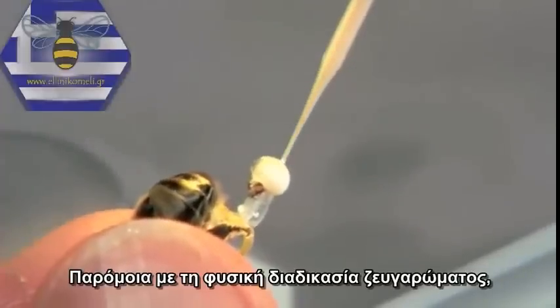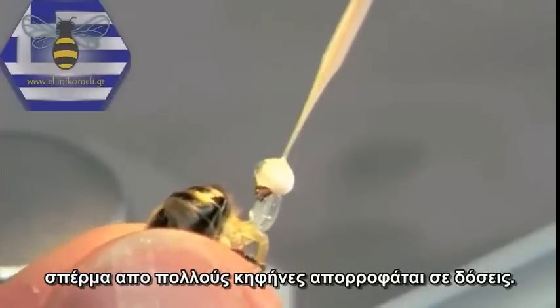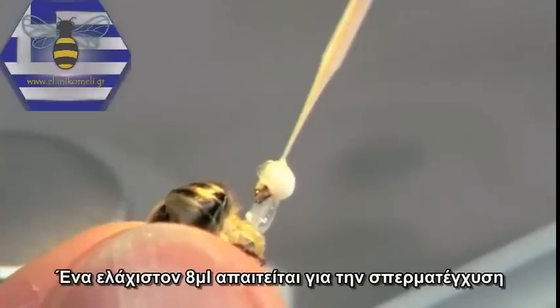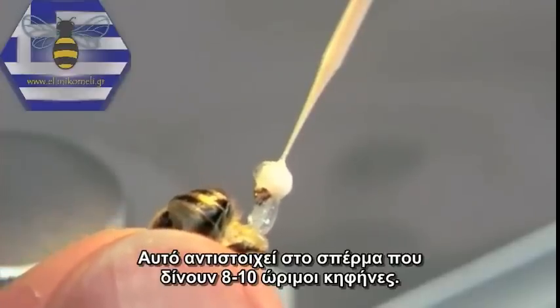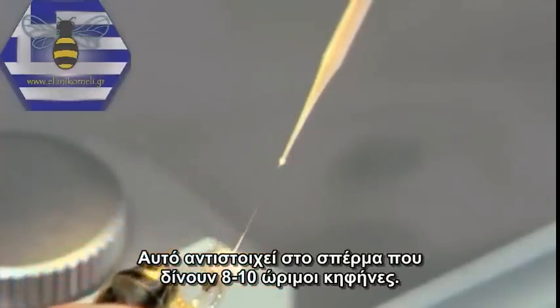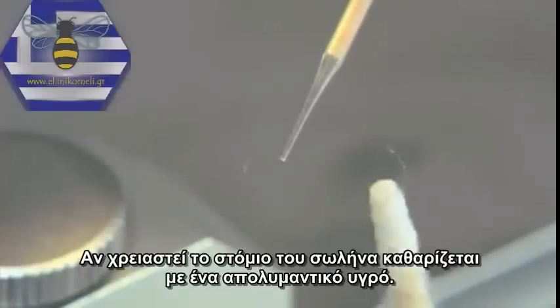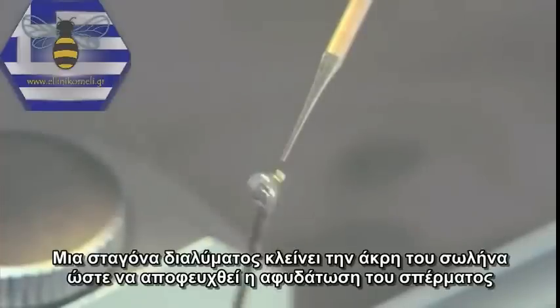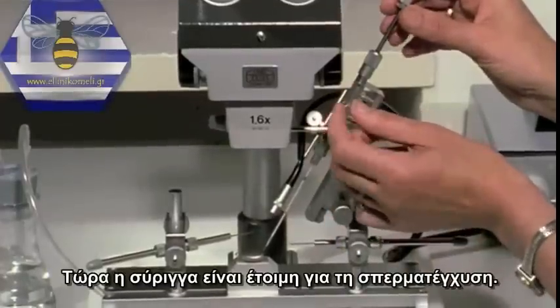Similar to the natural mating process, the semen of several drones is aspirated in portions. A minimum of 8 microlitres are required for insemination, corresponding to the quantity of semen donated by 8 to 10 mature drones. If necessary, the tip of the cannule is cleaned off with a sterile swab. A drop of diluent closes the capillary to prevent the semen from desiccation. Now the syringe is ready for insemination.